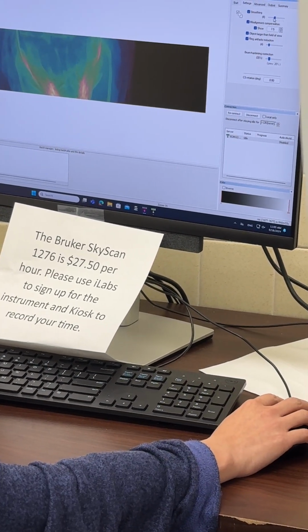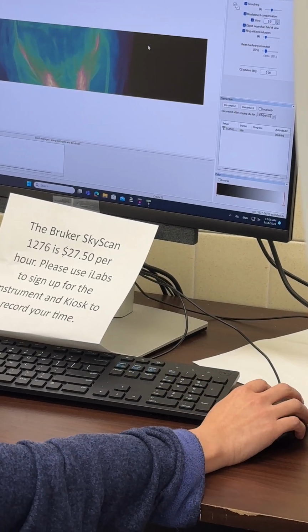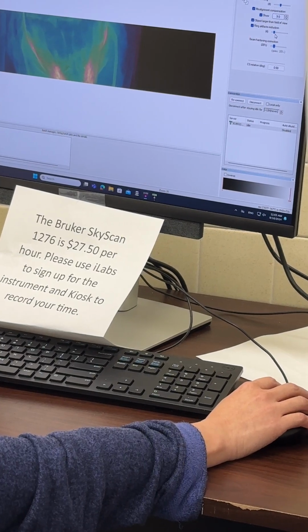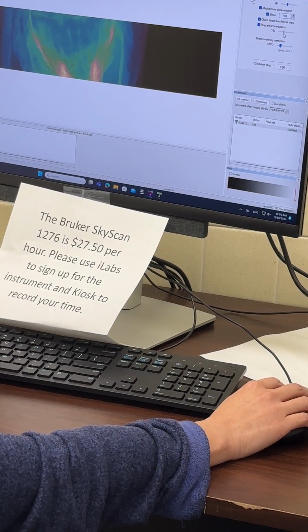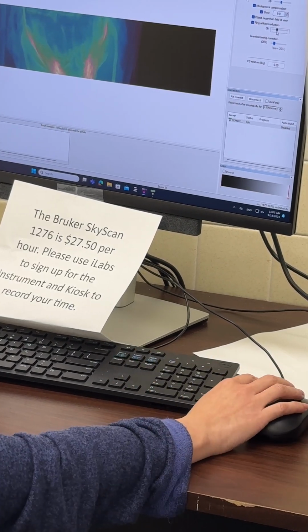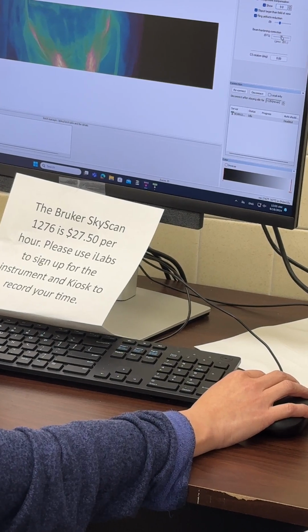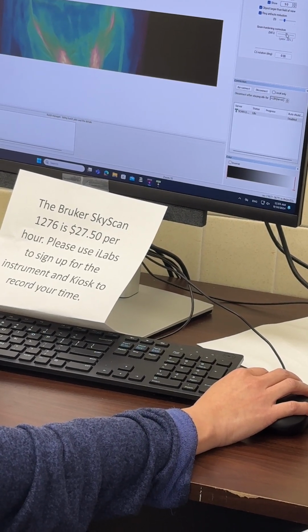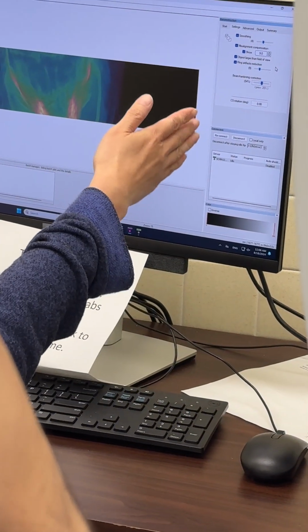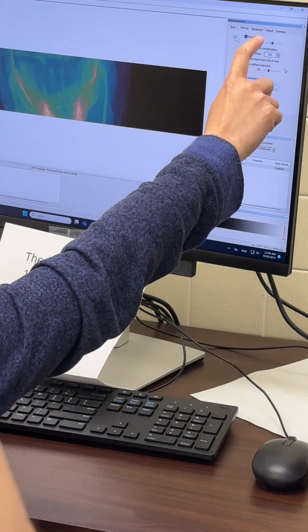This could be 4. This could be 9. And then I will adjust that later. And this is 9. This is 54%. So this is a basic setting. I put it here, and whenever I adjust it, I can move it a little lower or higher. But for this project, the surgery one, don't change this one, this one, this one.